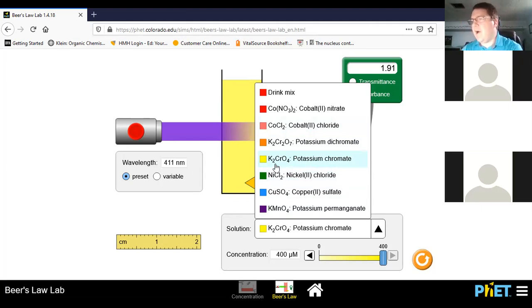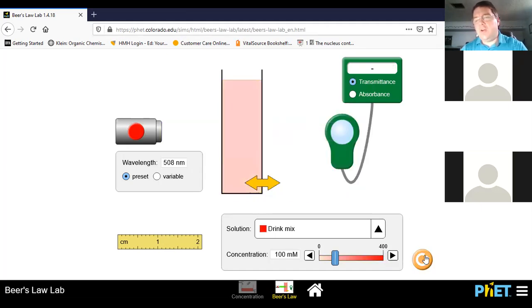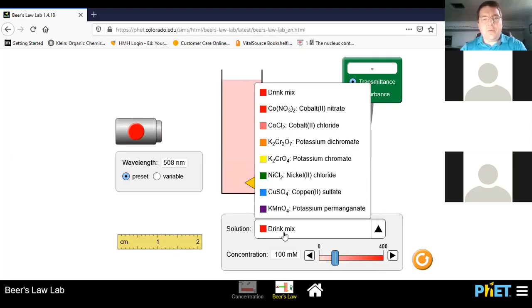If you look at the bottom of the page there, the very next section, if you're filling things in, investigating absorption and wavelength. What you're going to do is compare 3 solutions of different colors with the same path length, which basically means don't mess with the double-headed little yellow arrow here. Pick any 3 from the list here. Just make sure they're different colors.